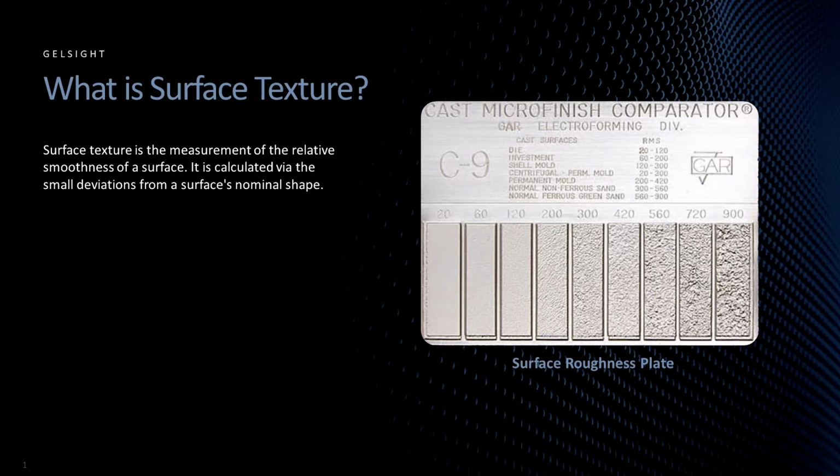In some cases, it can even be desirable to have a rougher surface texture on a part. For example, the post on a bicycle seat needs to have a high coefficient of friction so that it does not slip down easily while being adjusted.